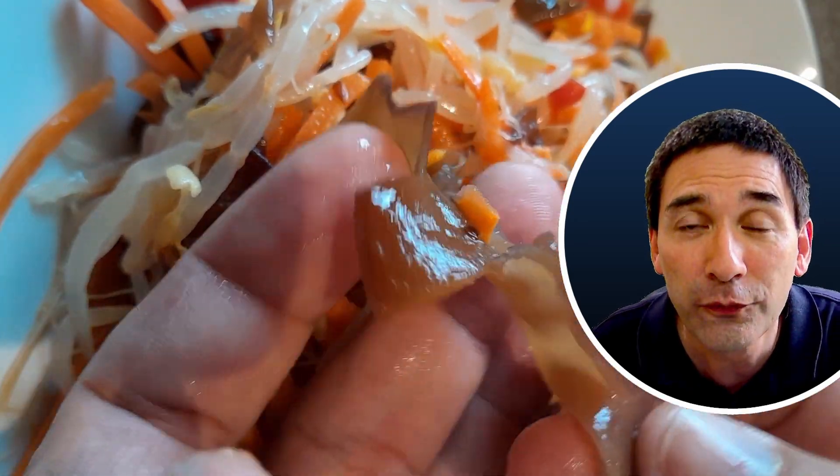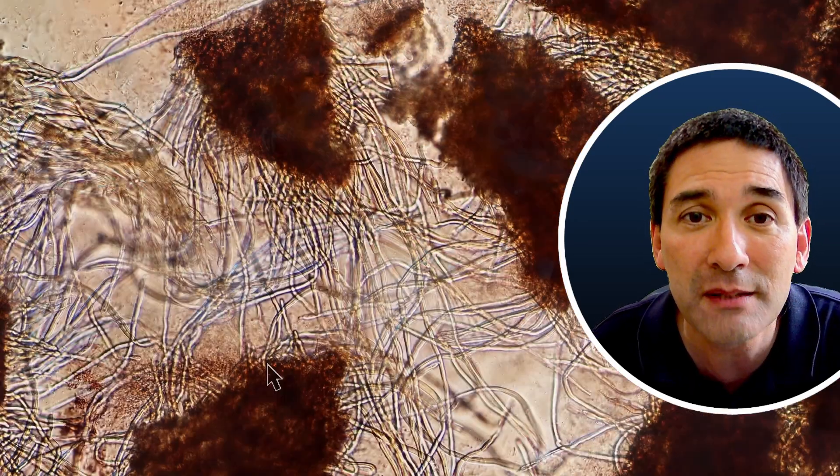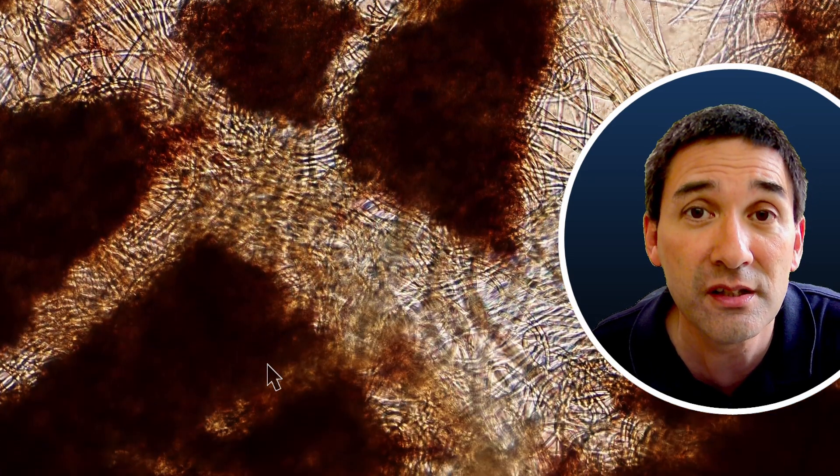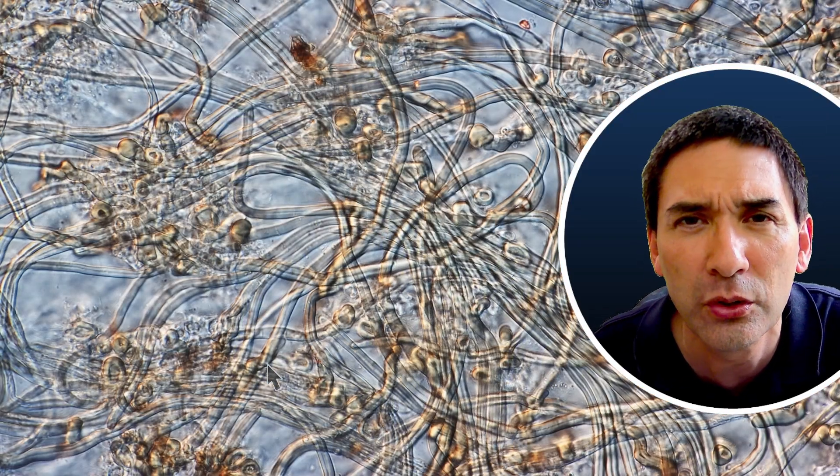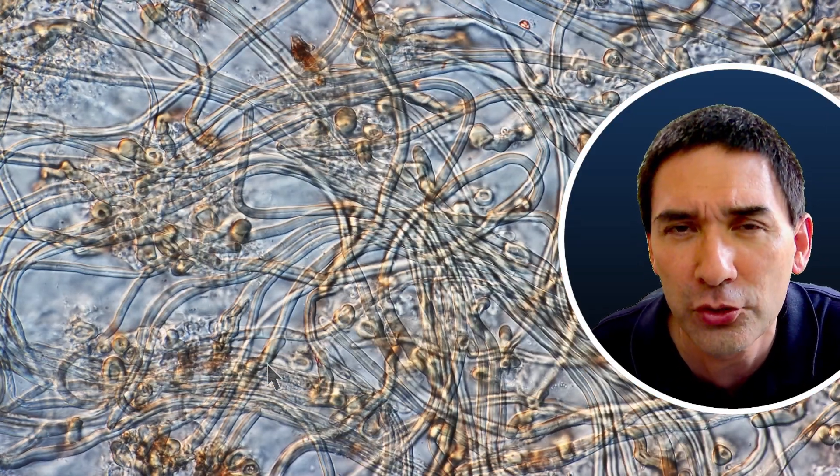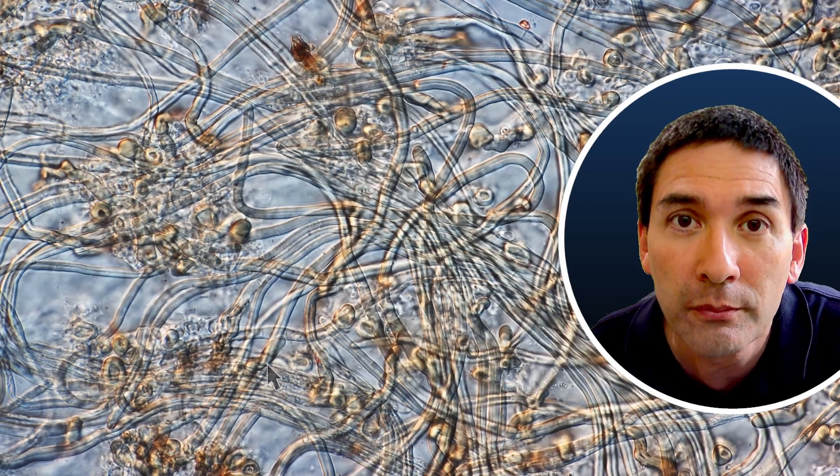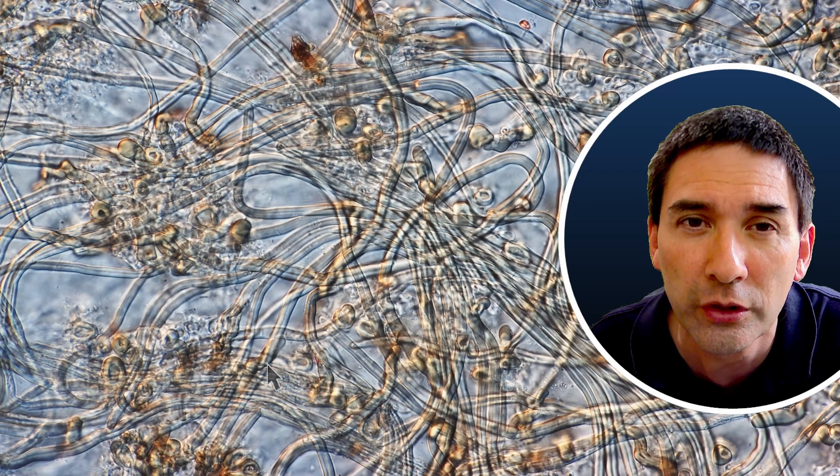What did I see? Well first I'm going to show you the unstained specimen. And quite a bit like I expected, I was able to see those string-like structures, those filaments, the hyphae. And this is actually nothing unusual. However, when I zoomed in at a higher magnification I said, well they kind of look different than the other fungi that I've observed so far. Those round oval structures of course are the spores, also nothing unusual here.